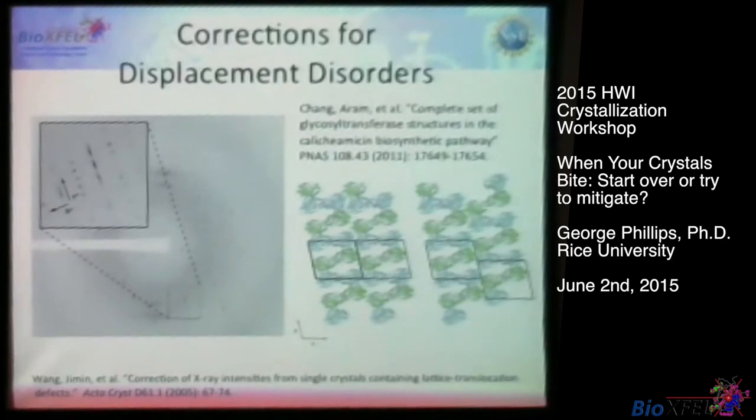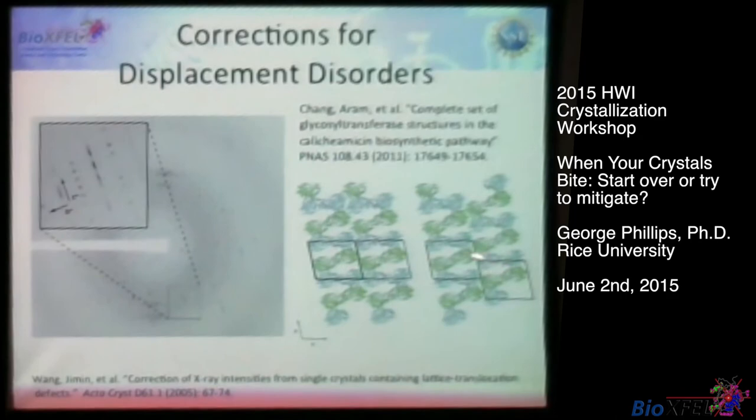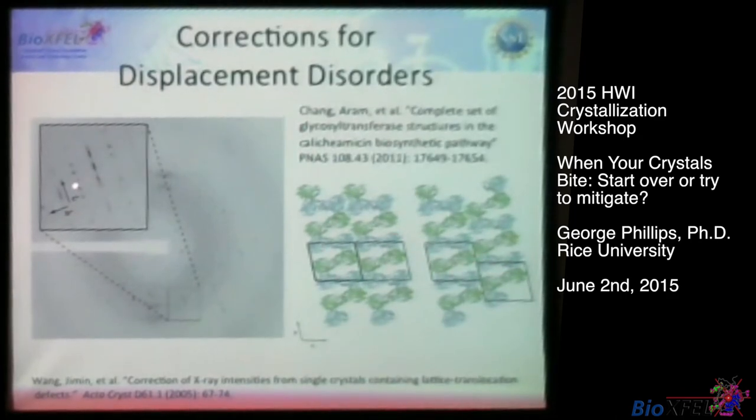Okay? Now, this is a case in point from some of our work where we were able to save a structure. Every other row in this diffraction pattern was these streaks. This corresponds exactly to what I described with diffuse scattering. There's a vector. The length of the direction of the streaks is the direction of the vector. And the buildup of where they are in space suggests these are transverse displacement waves with this certain vector. So basically what's going on here is that vector. Some of the unit cells are slid down with respect to the original one. It's commensurate because it's exactly the odd ones that are affected. The even ones are okay.